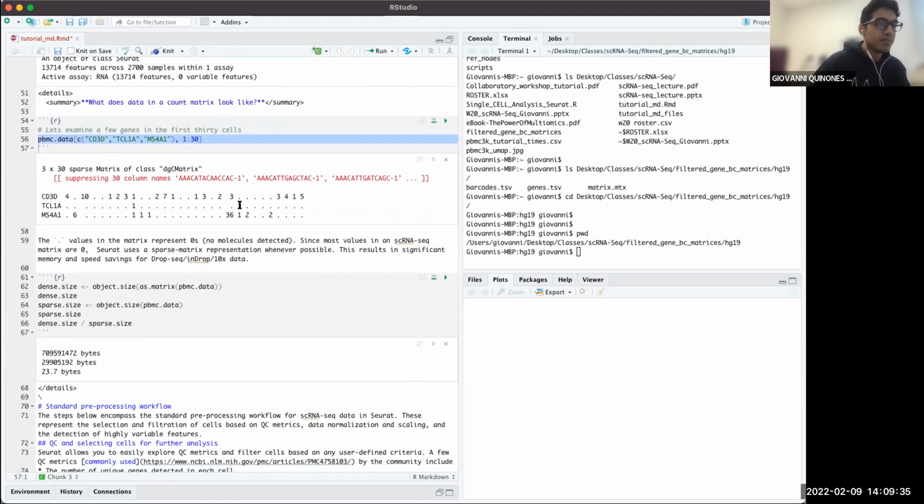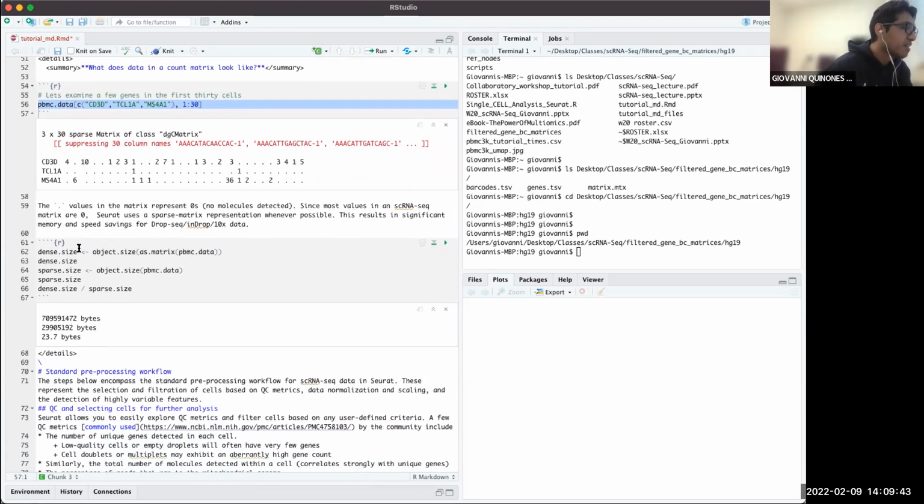Okay, hopefully everybody completed this step. Now the following step over here, we're still getting familiarized with our data set. And this is just a quick footnote in terms of the matrix. If you run the third cell, you see that these functions are just getting the size of the matrices, as in how many bytes it takes.